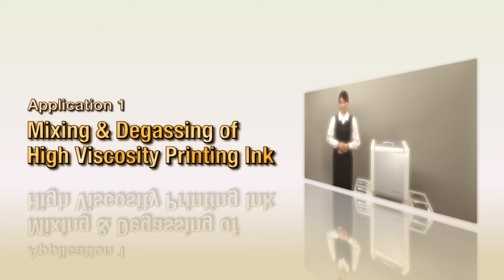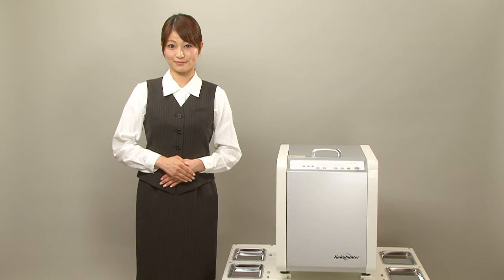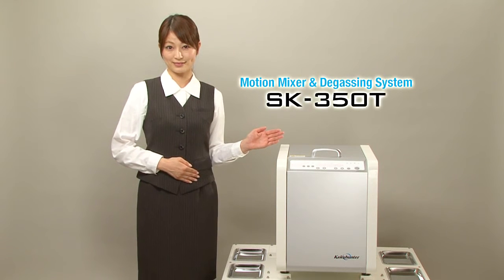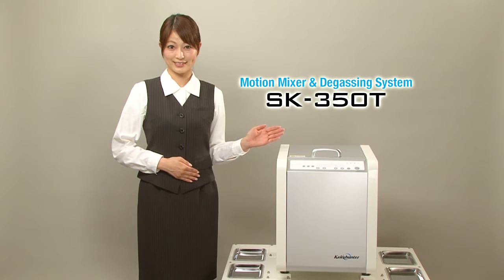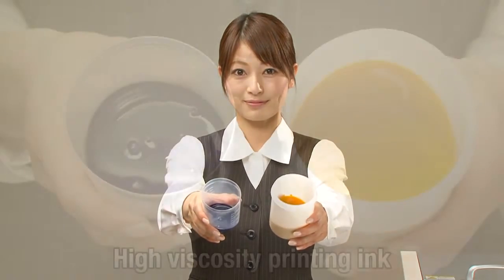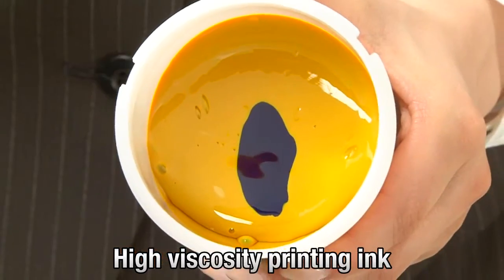Mixing and degassing high viscosity printing ink. We will now mix and degass a high viscosity paste using the SK350T. First, we prepare the materials. We will be using high viscosity printing inks.